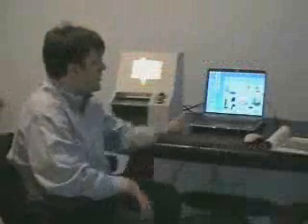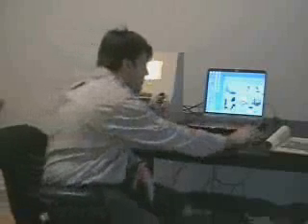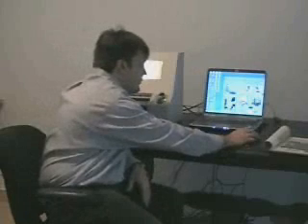Now that the software is installed, a desktop icon called Pillgrade 2.9 will be on your desktop. Simply click on that icon, and the Pillgrade software will come up.